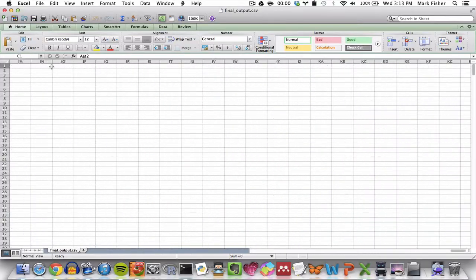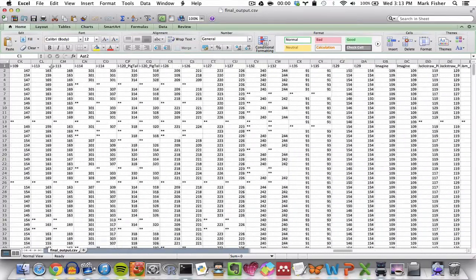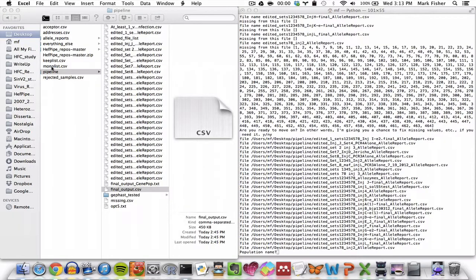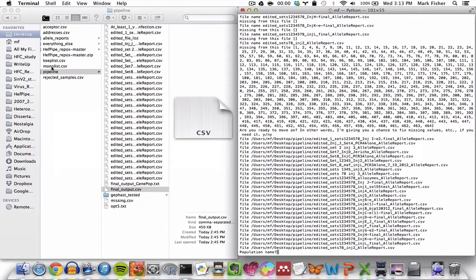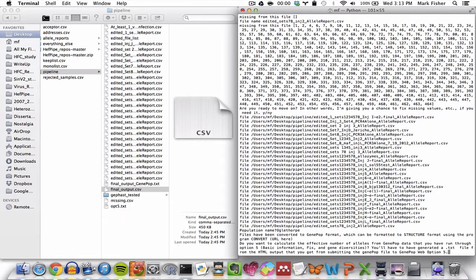So this is sort of your master genotype data file. Next, the pipeline prompts you for the name of the population. So you enter the name. In our example data, the population came from Oglethorpe County in Georgia, so we'll call it Oglethorpe, and press Enter. So remember in the previous video that there were restrictions for the population names that you could provide. So make sure you have watched that video.